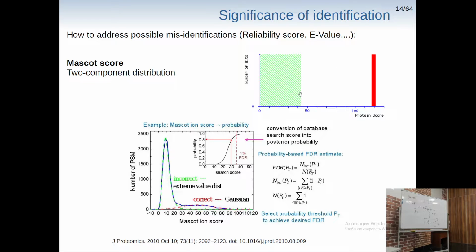This part is statistically insignificant, and if you have a hit here, you can say that it is statistically significant. It could be that it is a false positive, or it could match a lot of proteins at once, because it can be, for instance, let's say, a conserved domain, right? But at least this peptide matches this spectrum.